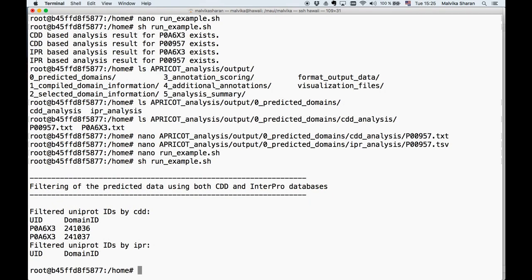As you remember, we were looking at this protein, which does not have an RRM, KH, or DEAD domain. However, this protein has an RRM domain, and therefore it should be our positive, and the other protein will be filtered out. So this seems to have worked.